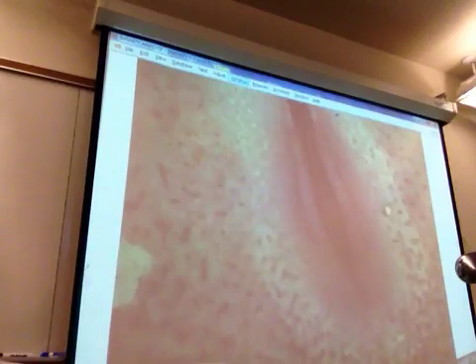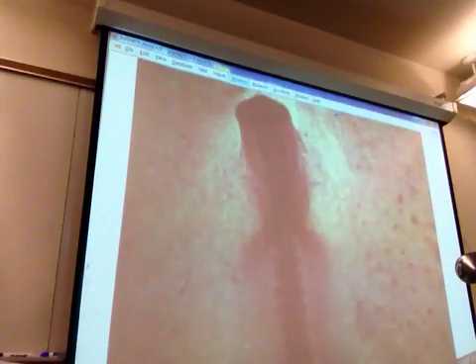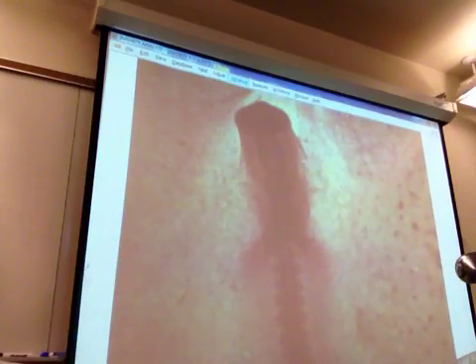So it looks like it's curving towards us. Definite head. I happen to know that there's a bend that goes like this, and so you can tell if you look really hard that this part is coming out towards us, and so that's why I'm saying top down. Yeah. And that these are somites. See all these beautiful somites, how square they wind up getting?